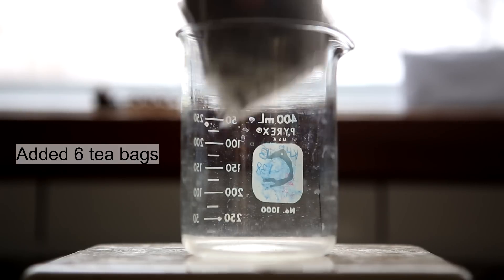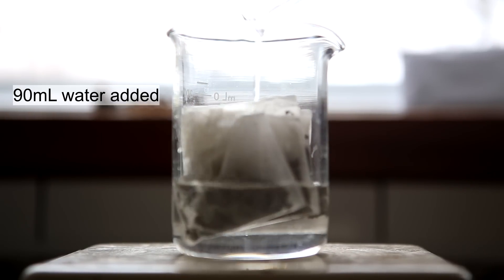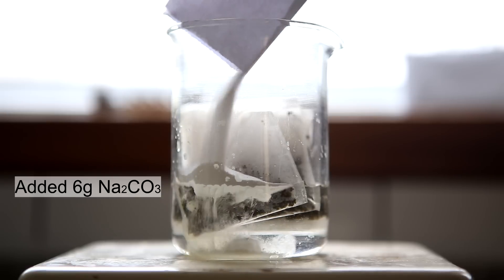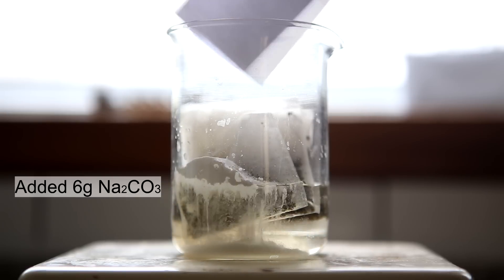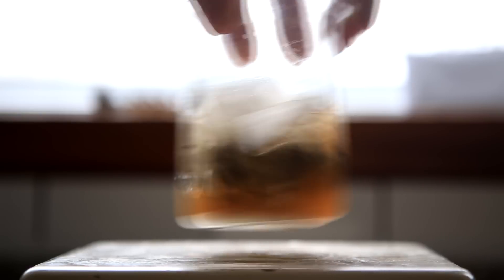Six tea bags were added to a beaker. Then 90 milliliters of water was added, followed by six grams of sodium carbonate. Once the sodium carbonate is mixed thoroughly, the solution is brought to a boil.